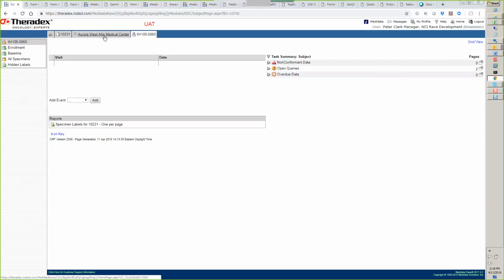Yeah, we need to know the time that the specimen is drawn, so that would be probably in the biorepository role, but we need to know when the dose was administered to make sense of when the specimen was drawn relative to that time of the dose. Sure. Okay. Well, I'm taking note of this. Yeah, but that would be for all PK, definitely. Yeah. So Diane and I will get back to you on that. But it sounds like for now you've got the read-only all sites role. You should be fine.